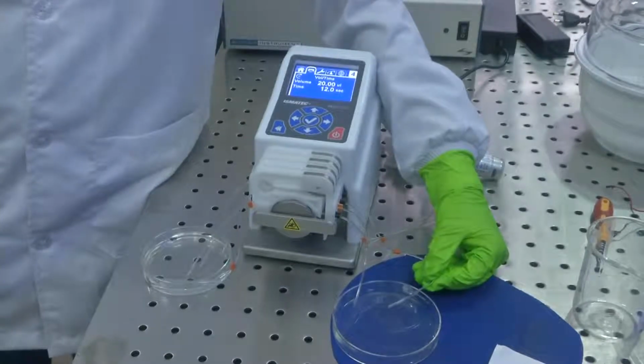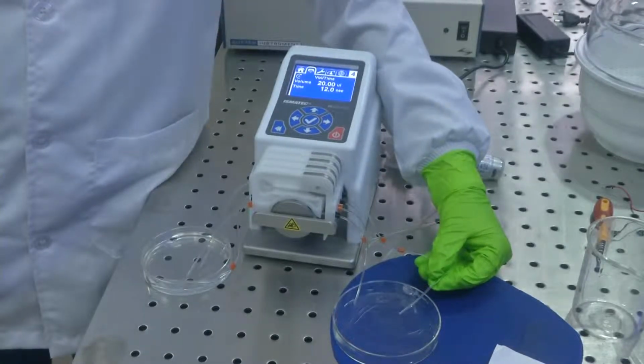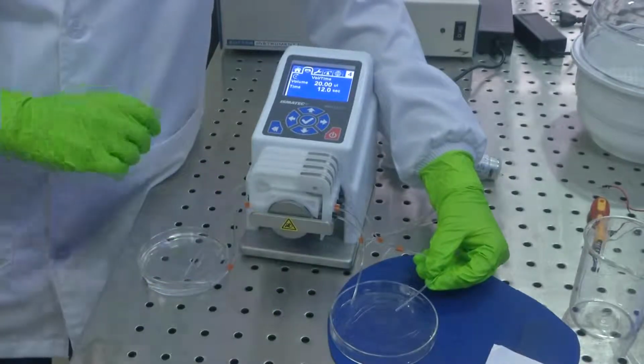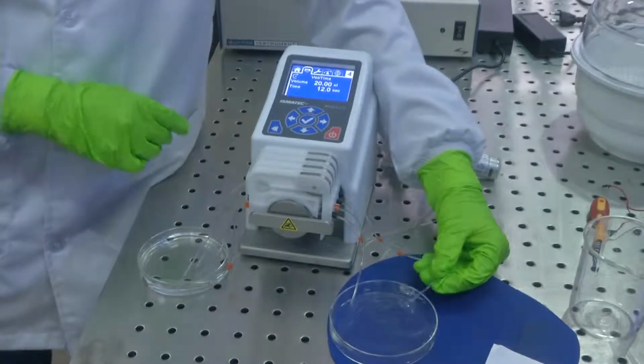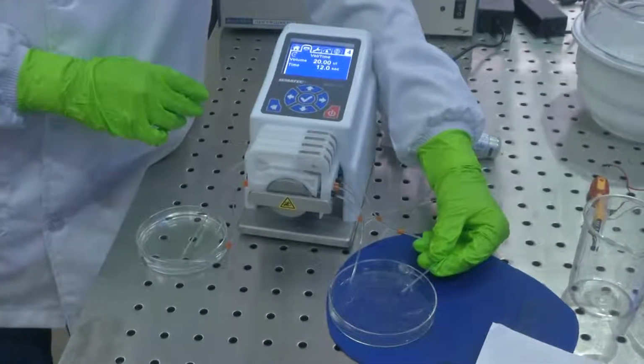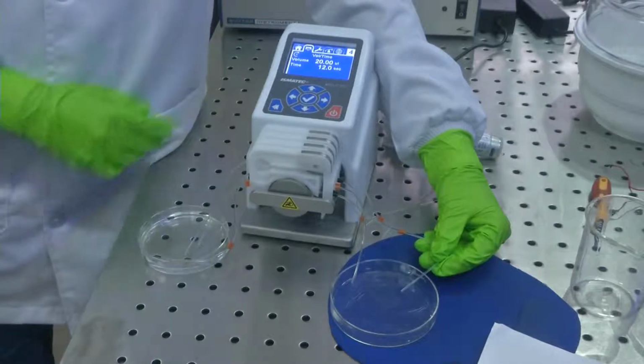The one in Suman's hand, he is holding the 4th channel, and then the other one is the 3rd channel. So, let us see, in 12 seconds there should be 20 microliter of fluid which has flown across the 4th channel.